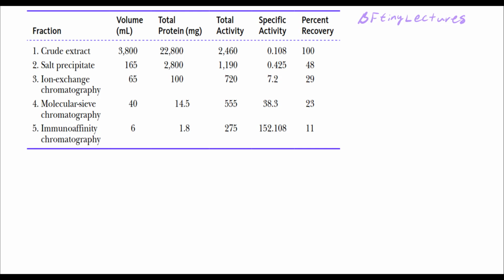So before you even start calculating any equations or measurements, you have to know that in order to begin the process, you have to break down the cell, right? So the cell has some proteins in it, right? So the cell is a square and the protein is the letter P. Well, we have to break down the cell in order to get to the proteins, because let's say we want to measure the enzymes within the protein. Well, we're going to have to break it down, and that process of breaking down the cell is called homogenization.